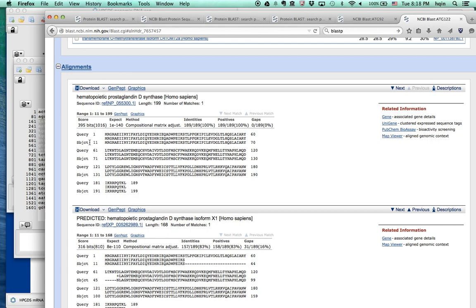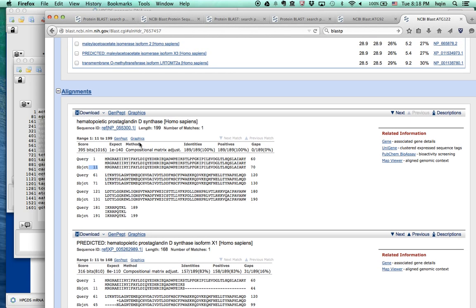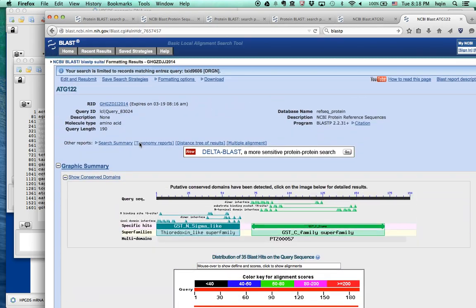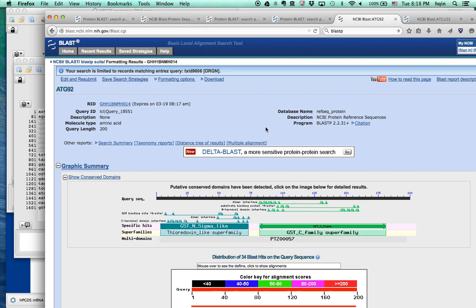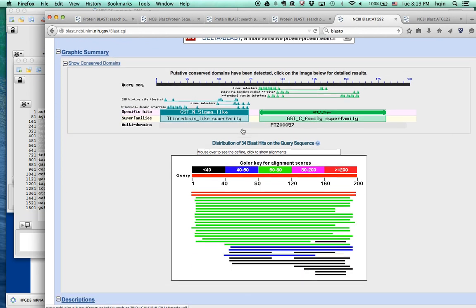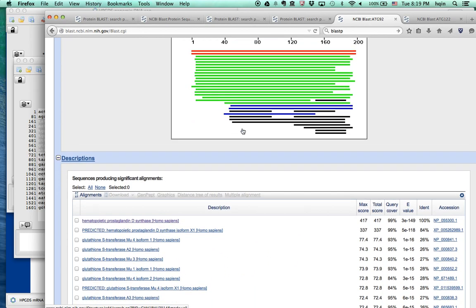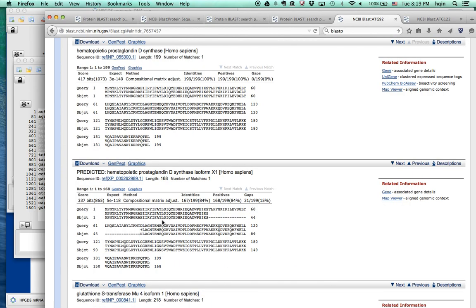So, the subject is the NCBI record. So, that means the first 10 amino acids is missing. So, when, so basically, ATG start at 122 is missing the first 10 amino acids. Each amino acid is a codon. So, that's 30 base pairs ahead of 122. It's 92. So, 92 should give me a better alignment. I go back to 92. There. So, it's 1 to 199.